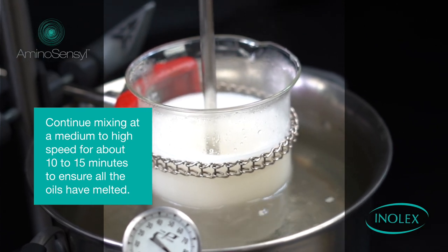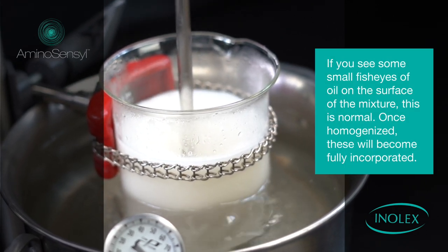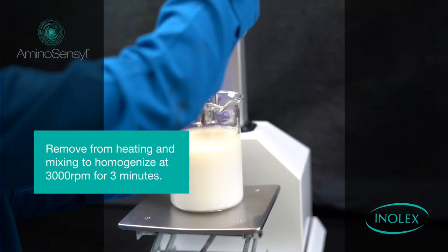If you see some small fish eyes of oil on the surface of the mixture, this is normal — once homogenized, these will become fully incorporated. Remove from heating and mix to homogenize.